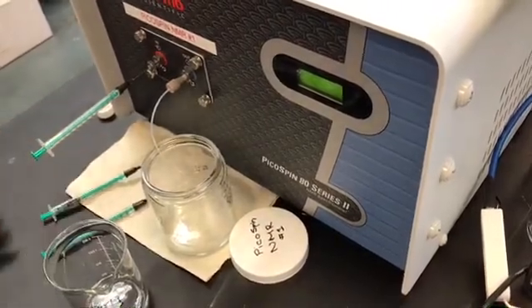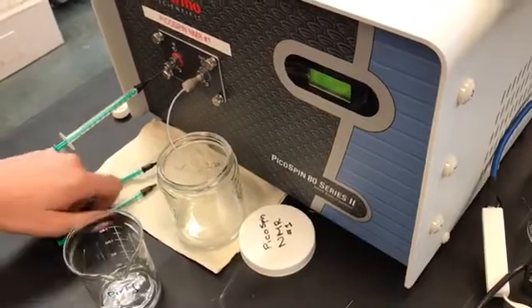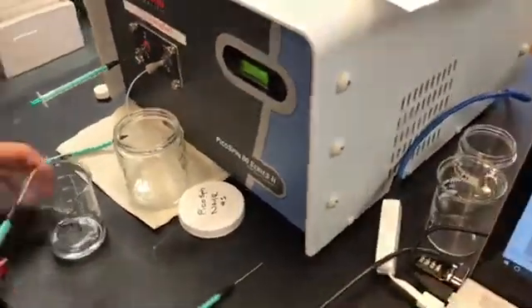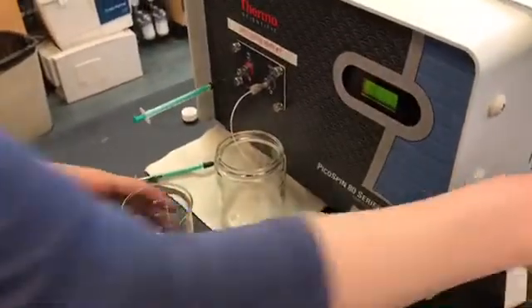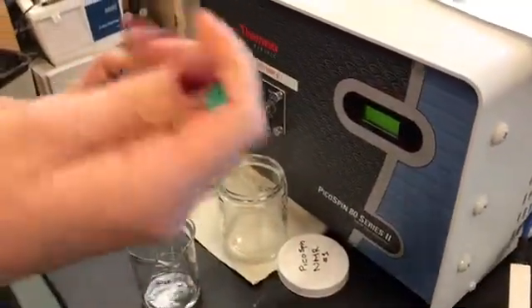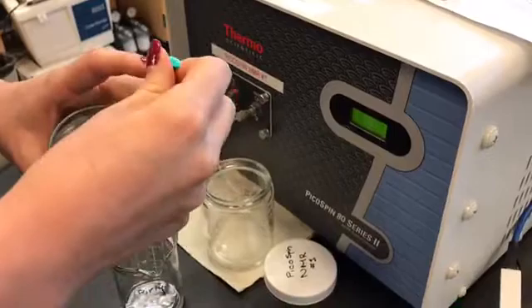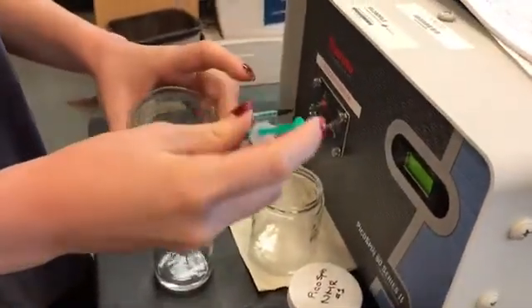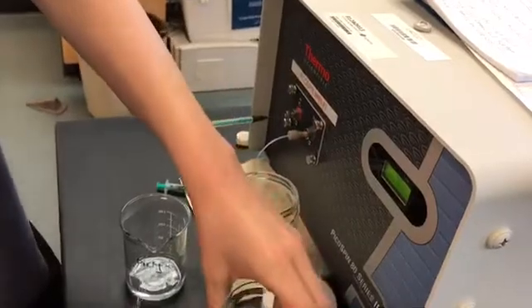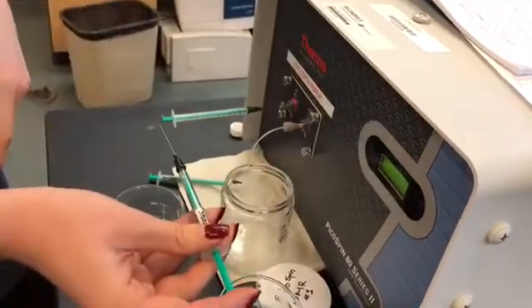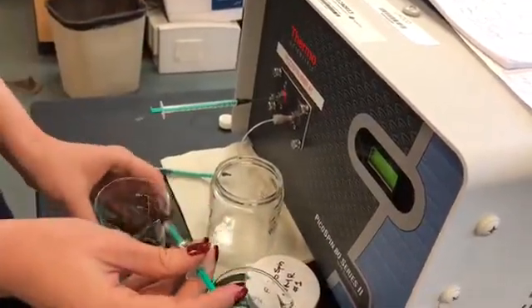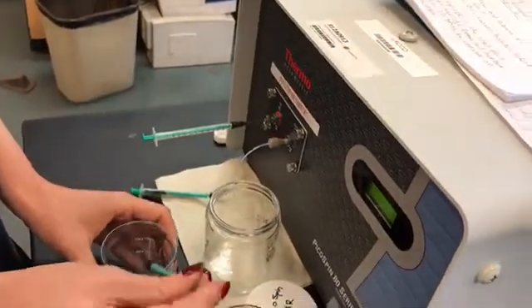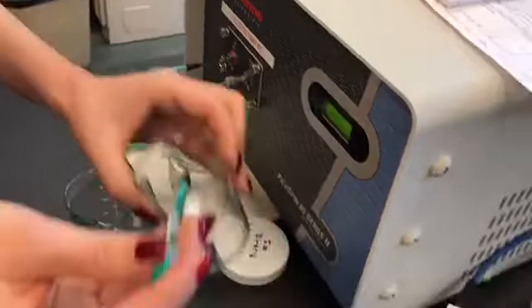So to clean out your sample syringe, we're going to flush it two times with acetone. So I got some acetone into my syringe. I'm going to put that in the waste, and I'll do that one more time.